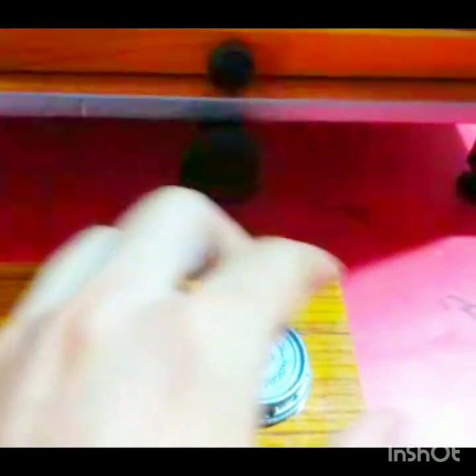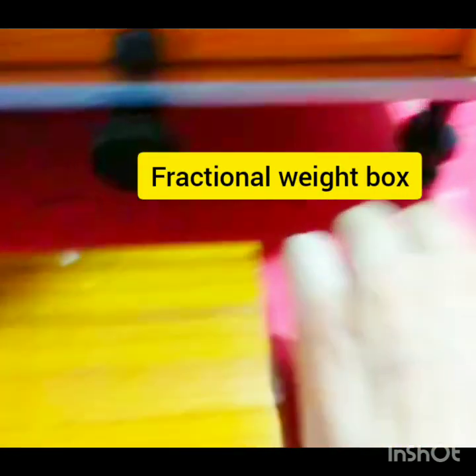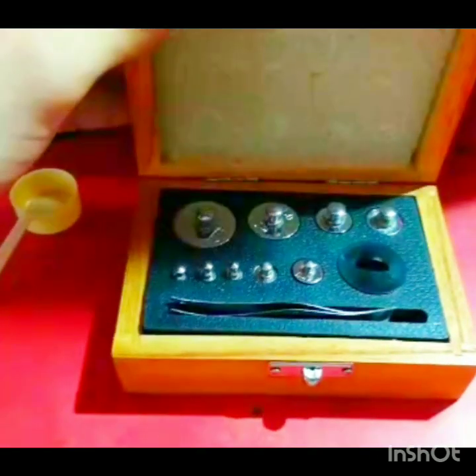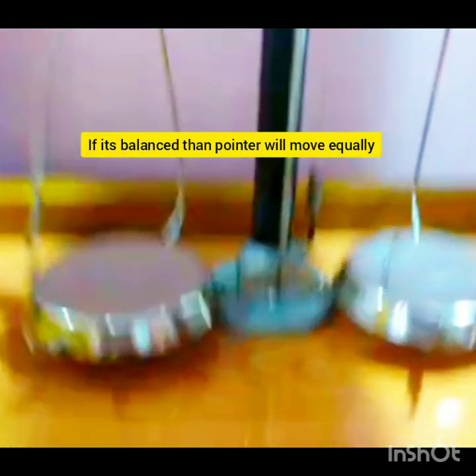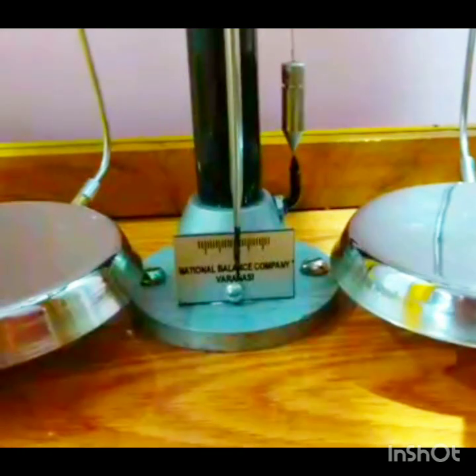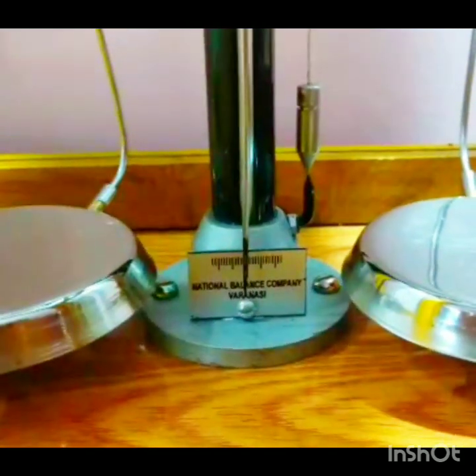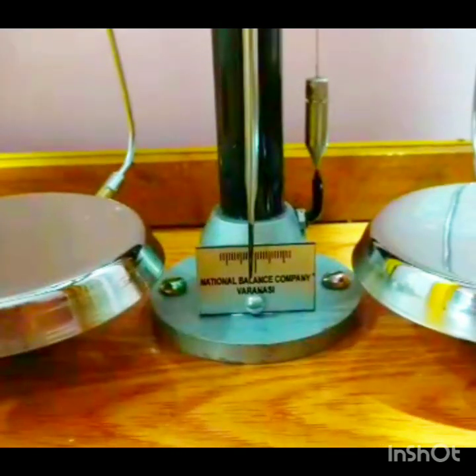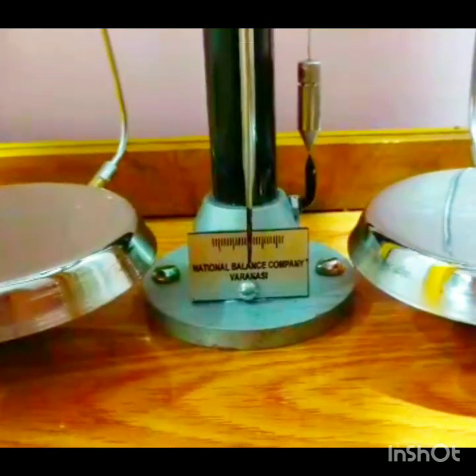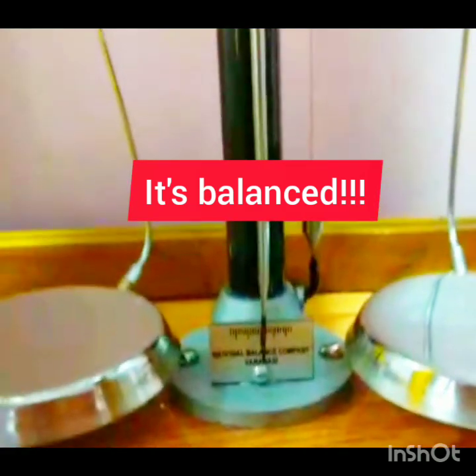You will need a fractional weight box and a standard weight box. First, to see whether your balance is balanced or not, count oscillations: left side one, right side one. We can see our balance is balanced.